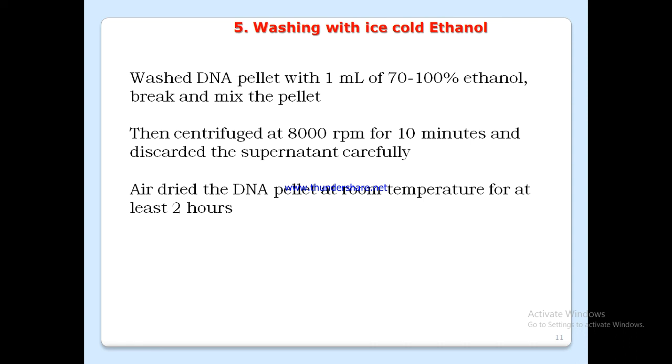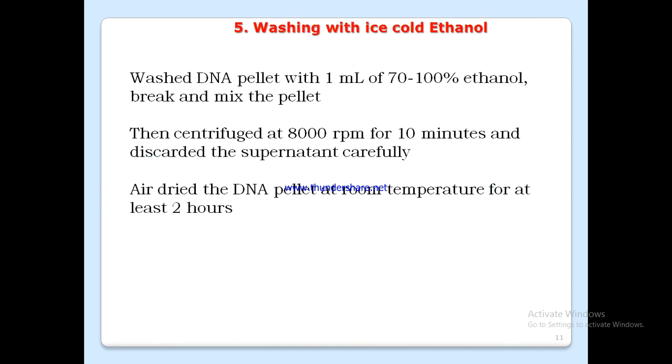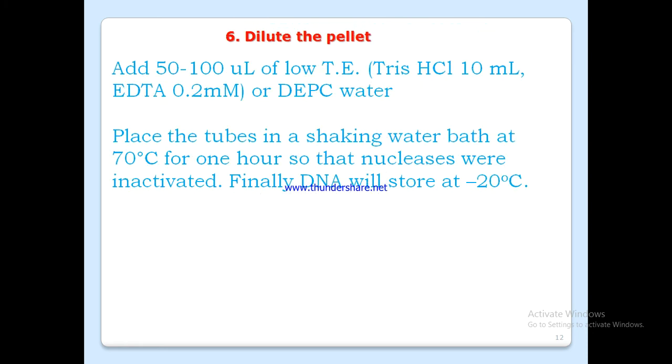Organic extraction and inorganic extraction. Advantages: yields relatively pure, high molecular weight DNA. DNA is double-stranded, good for RFLP. Disadvantages: time consuming, requires the sample to be transferred to multiple tubes, which increases the risk of contamination, and involves use of hazardous and smelly chemicals.